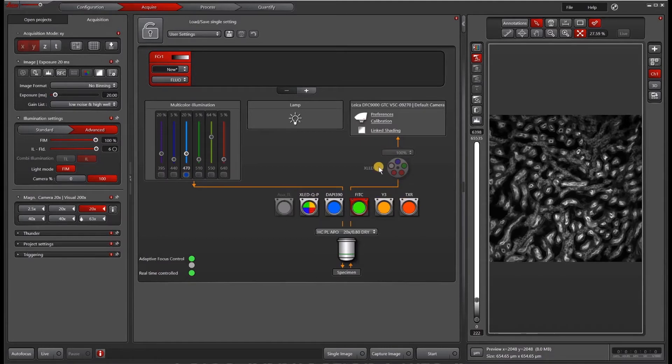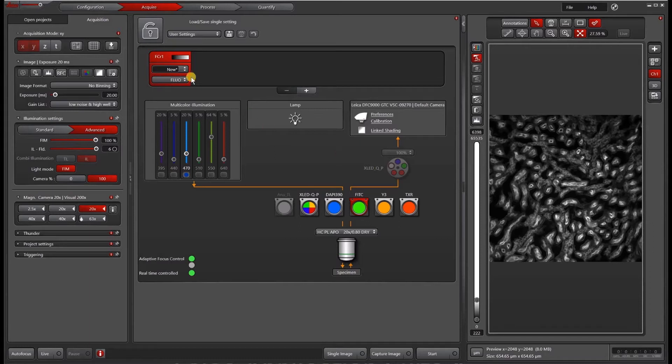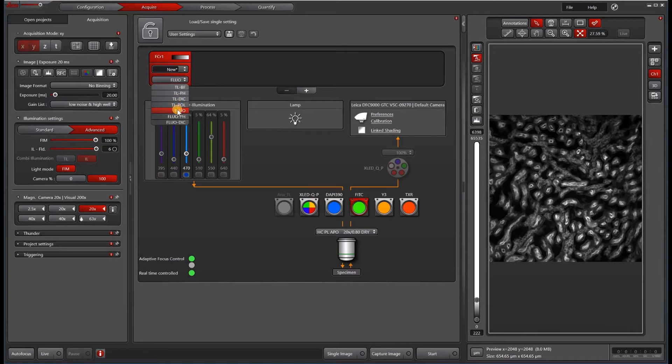On some systems, we also can put in an excitation filter wheel as well. To get started, we start the same way as we would normally, which is to come here to your channel and choose Fluo. Fluo will allow you to click through the different cubes.